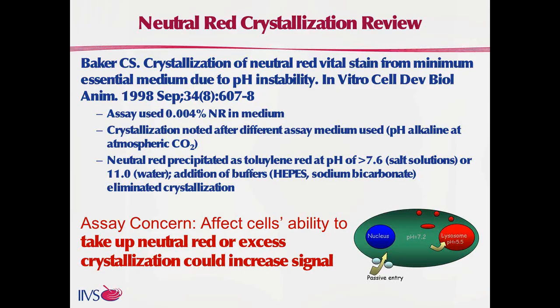So if we have a crystallization event, the first concern would be, will that be able to get into our cells? And the second concern would be if we have crystallization in excess, if it attaches to our cell membranes or it remains adhered to our plate, we could inflate our final optical density signal.